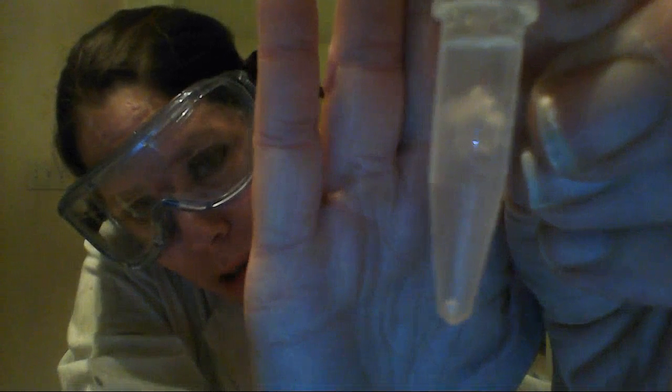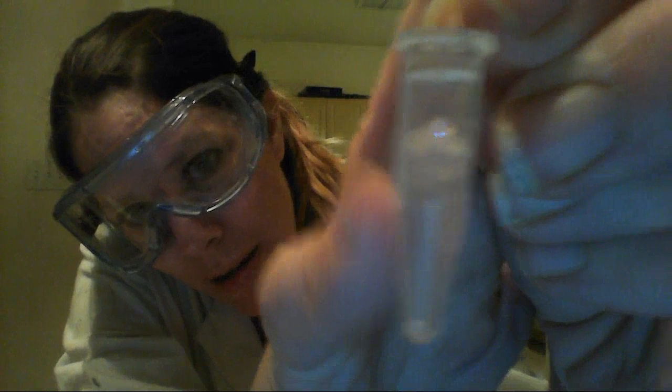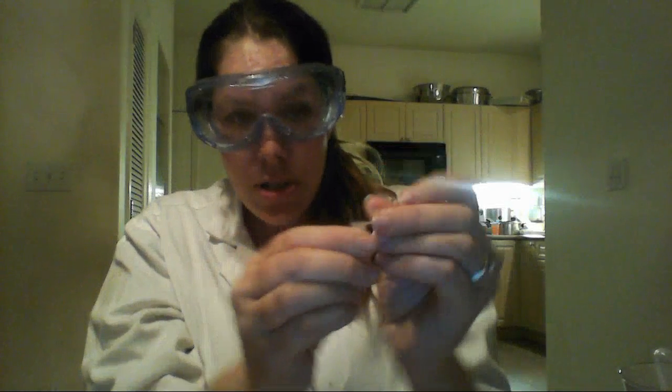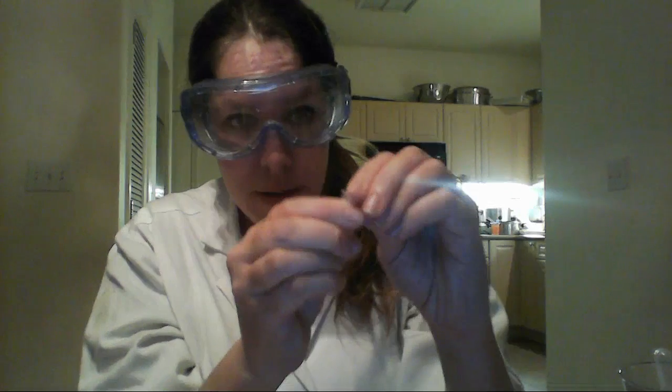Let's see if I give it a background, if that makes it. Can you see that DNA? It's that big clump of white stuff, kind of about right there. See if you guys can see that. That's my DNA. Just make sure there's enough liquid so it's suspended in there. And now you want to very gently cap this.